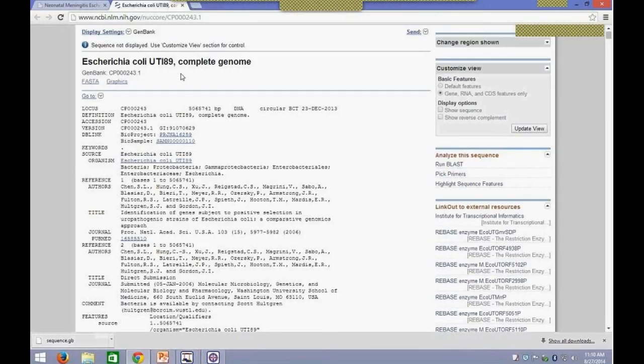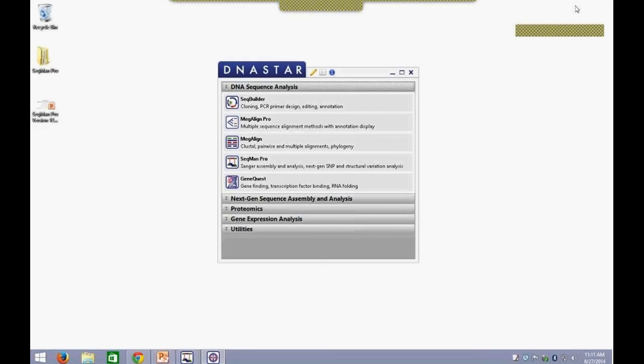We have aligned this against the E. coli UTI 89 genome. We expect it to have spotty coverage just because the two organisms are both E. coli but they're not very similar at the genomic level. But they do give insights into where certain areas of interest may be between the two organisms. So this is the background of the alignment I'll be showing you today.